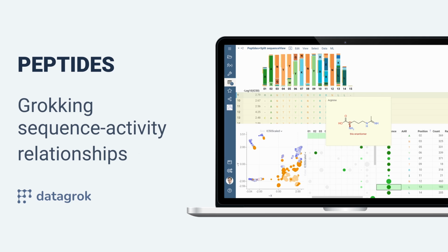Hi everyone, my name is Leonid and today we are going to learn about peptides analytical features and application designed at Datagrok. This application aims to deal with peptide sequences and associated activities to process sequence activity analysis.